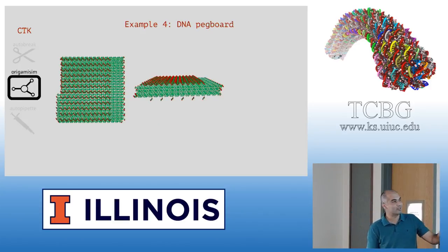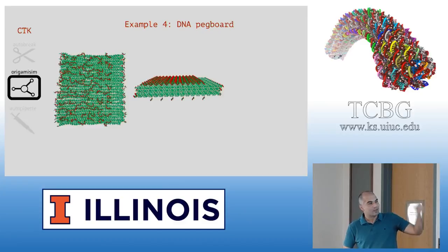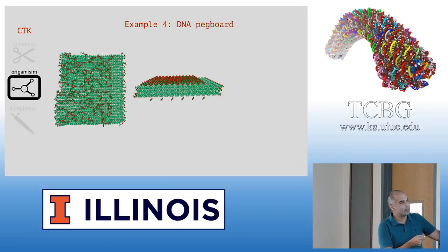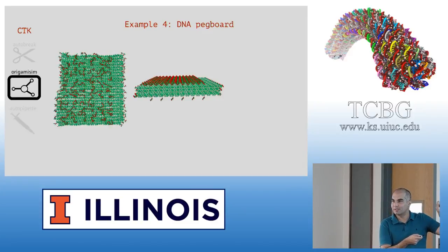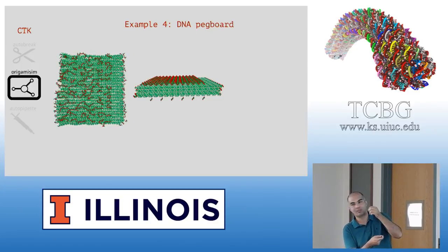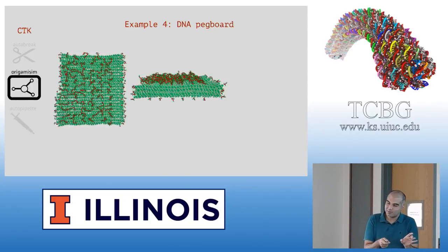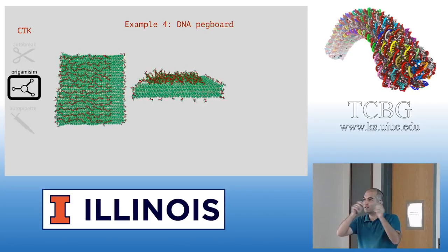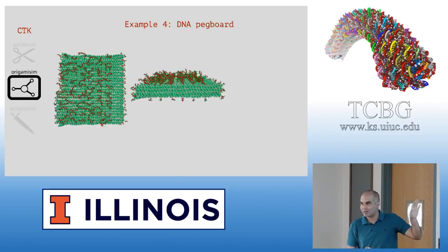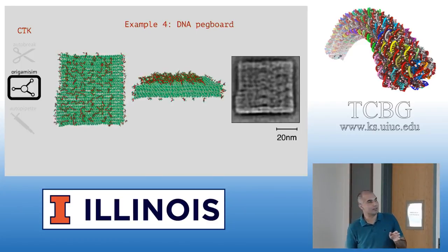And then I'm showing something that I actually designed for a collaboration with Whale Lab at UCSF. I just needed this kind of tool to actually see where the handles are. We attach things on it, and ideally I'll also put different things on it so that I can see how they look. Because when we discuss designs, we usually just talk about what the distance between things should be, and then look at the protein being this big, and I should have this much space. I needed this kind of tool to do it graphically, which is much easier. And this is actually how the design looks.